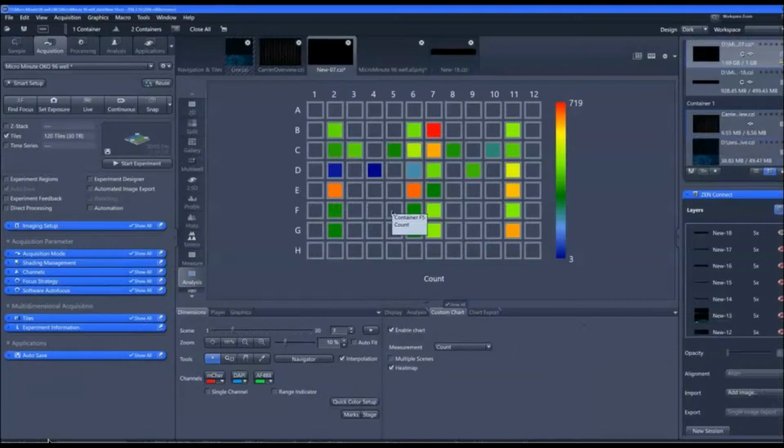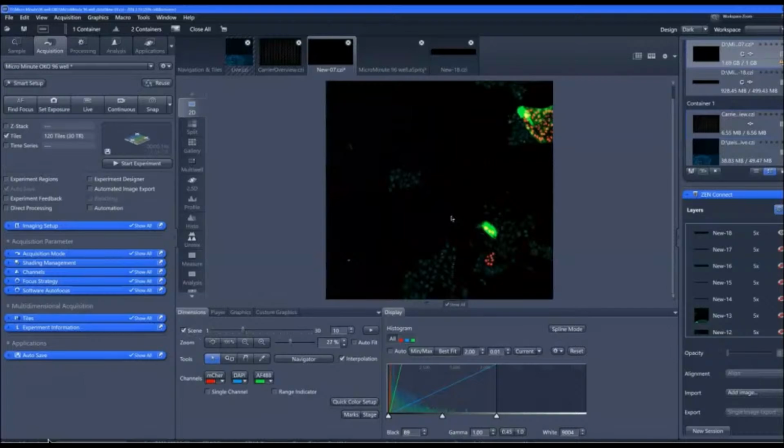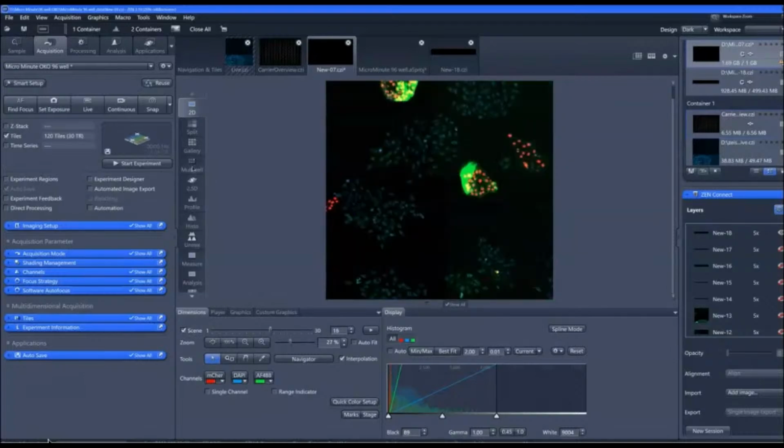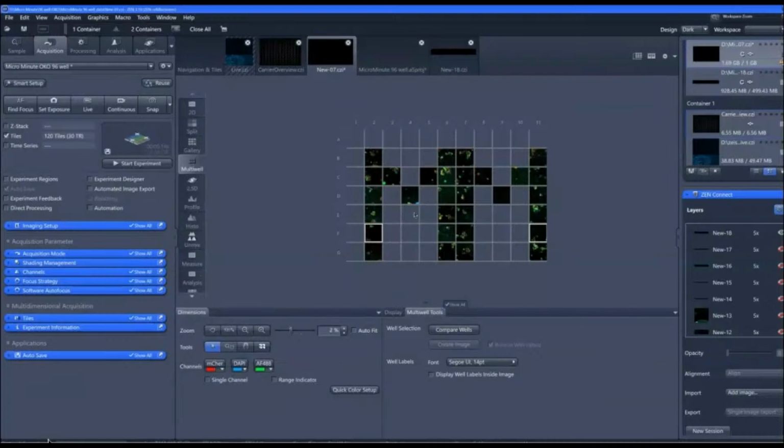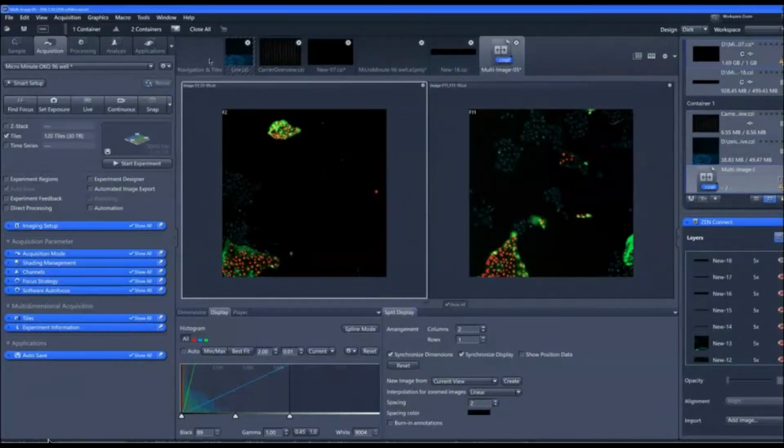And I actually have a bioapps image analysis applied on this data set. But let's go back to the 2D view, and if I click on individual scenes, you can see individual scenes. But what is really cool in the latest version of this software is you can see the multi-well view. So the multi-well view gives you all of the scenes that are acquired in these letters M and M. And it also allows me to highlight wells. For example, I could highlight any of the wells that I want to compare, and that gives me a very nice way to compare images in a side-by-side view.